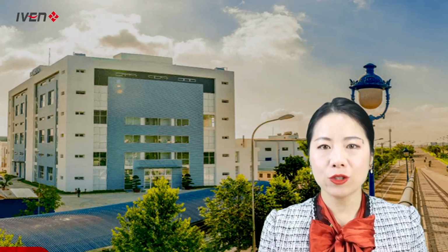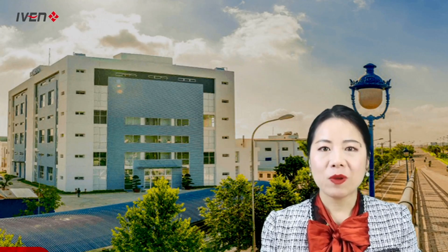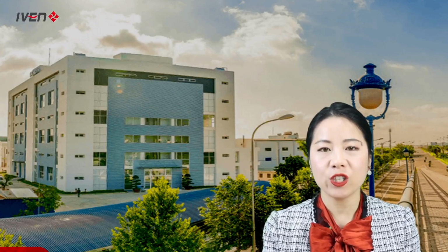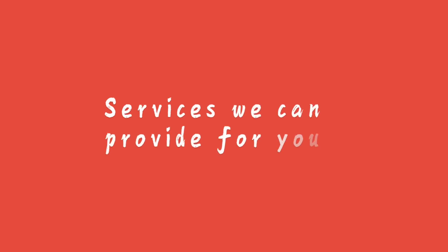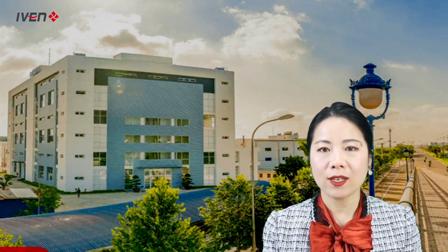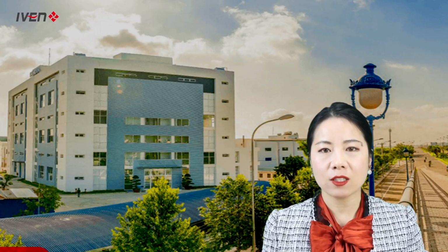Today I would like to introduce our injectable vial turnkey projects. Before I introduce our turnkey projects, I would also like to share with you the services Iven can provide to you. If you want to set up an injectable vial turnkey project, we can give you a turnkey solution from A to Z.